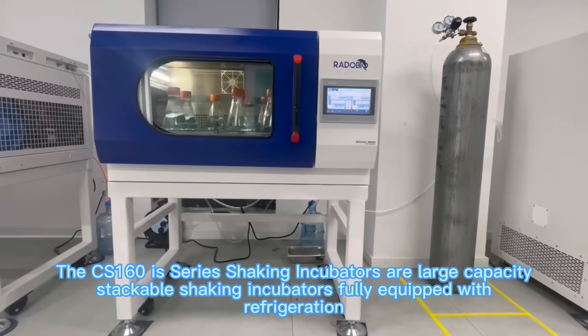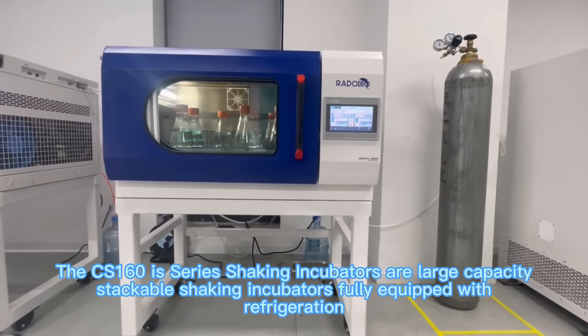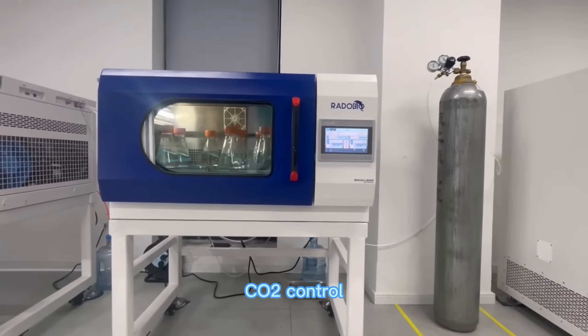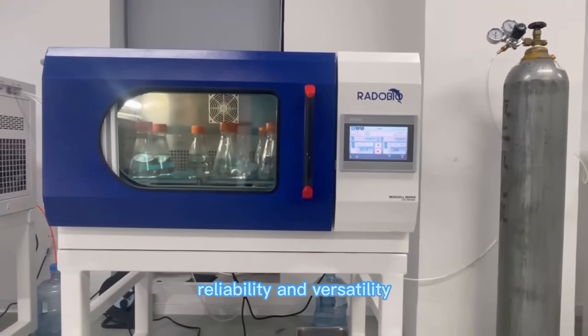The CS160 Series Shaking Incubators are large-capacity stackable shaking incubators fully equipped with refrigeration, CO2 control, and UV Sterilization that combines high performance, reliability, and versatility.